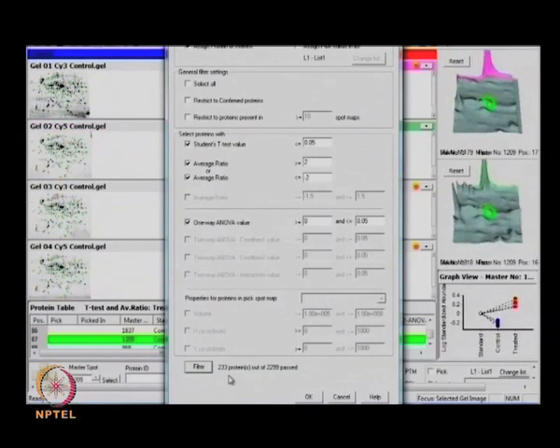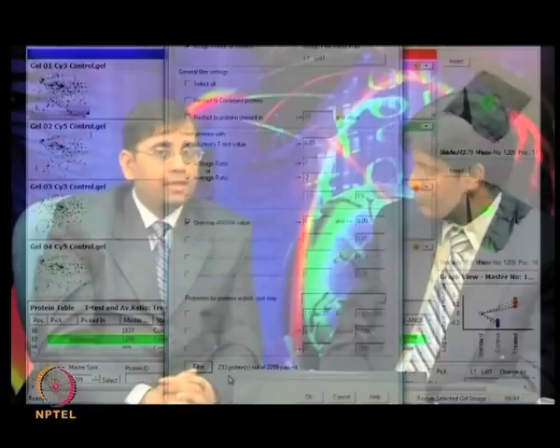So, can you elaborate on what EDA or extended data analysis is, what it can do, which we are unable to do in BVA? So, there are layers here, right? One is DIA followed by BVA, and then ultimately EDA analysis. Exactly. Basically, what we can do here is compare two BVAs together. Here we are talking about a particular disease or particular set of data only. There we can analyze different BVAs together in EDA. There you will get majorly differential expression, as well as PCA and discriminant analysis. These kinds of statistical data you will get in EDA.